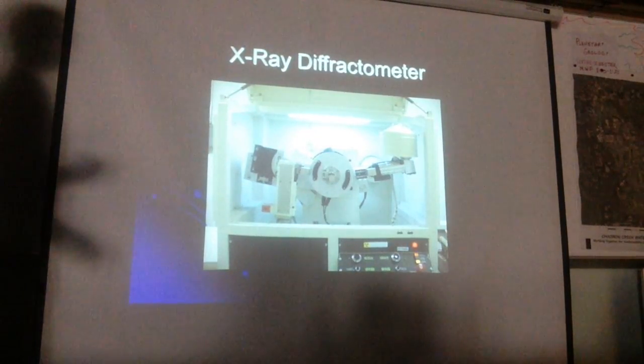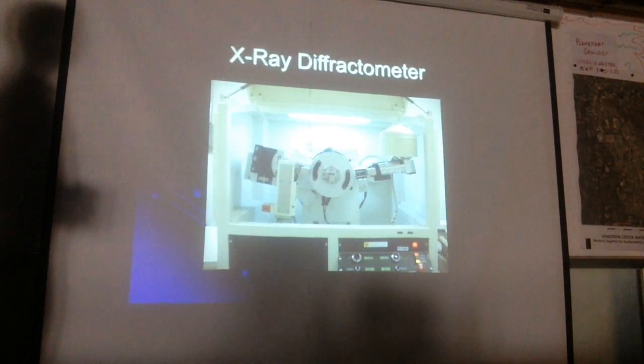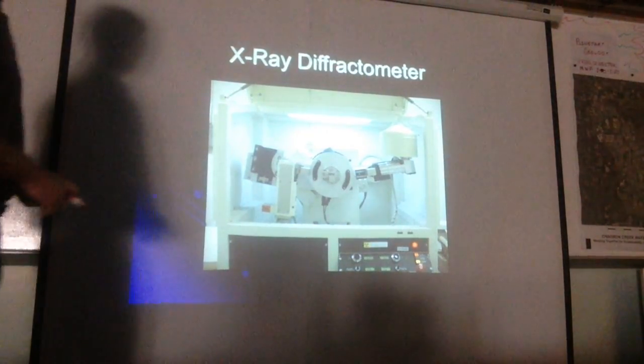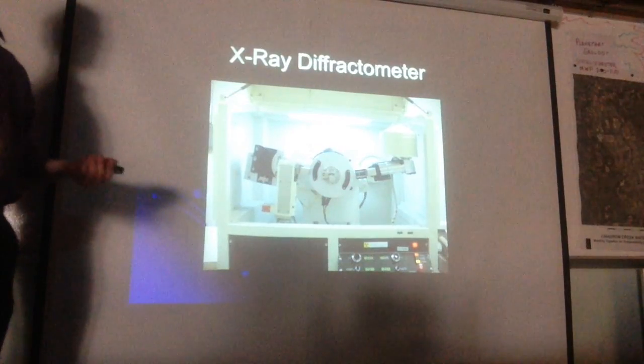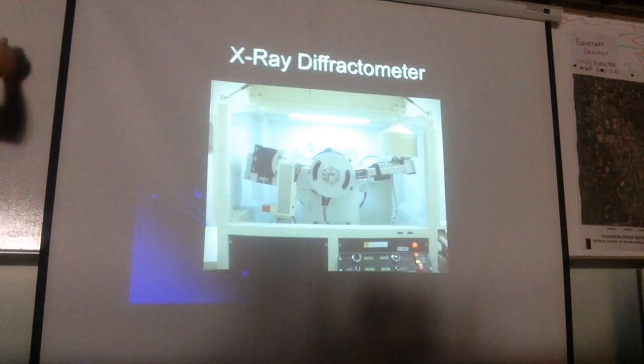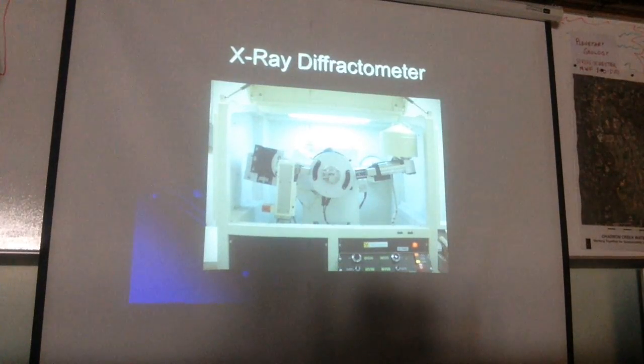And most modern XRD machines have fail-safes built into them so that you can't necessarily open it while the X-rays are occurring, but there are some older ones and some different models that don't have all of the really nice safety features. But anyways, your sample tray looks pretty much like a normal petrographic slide.